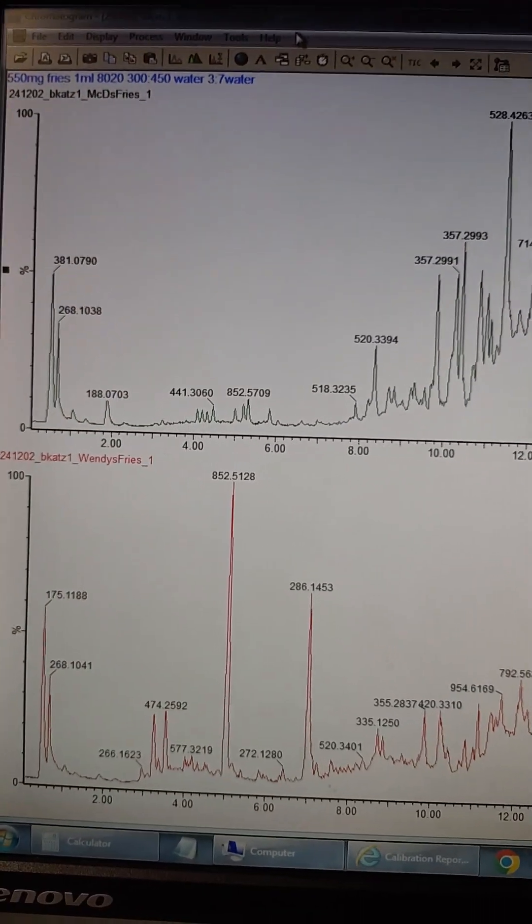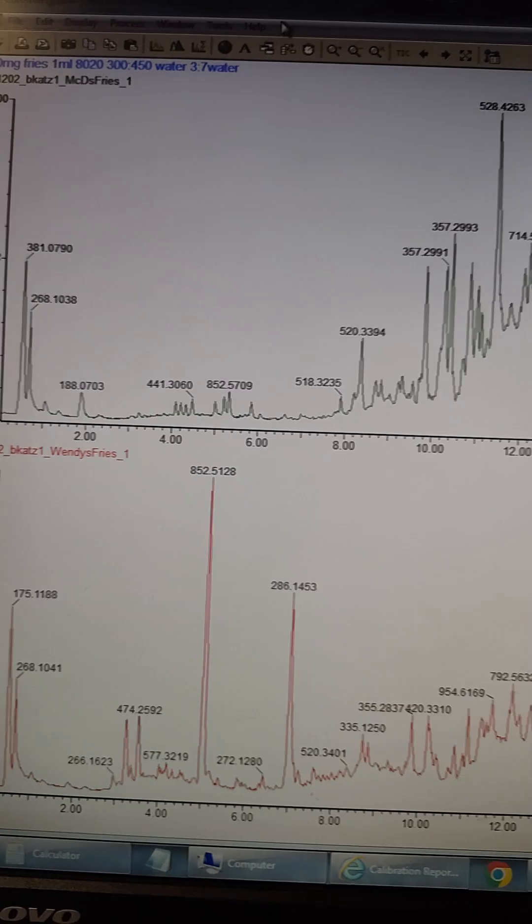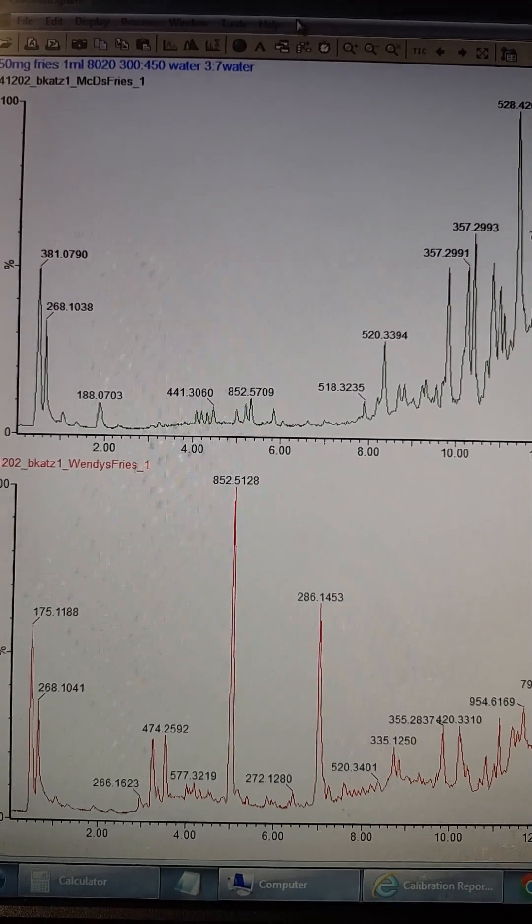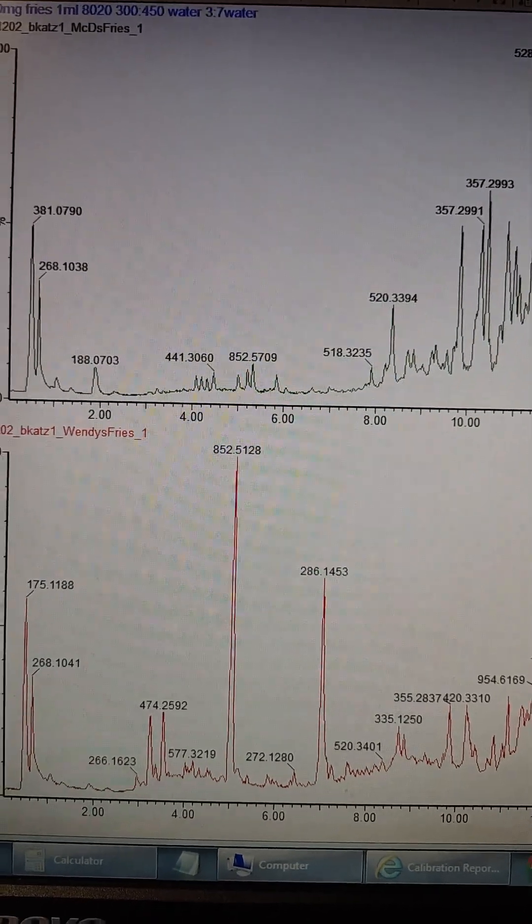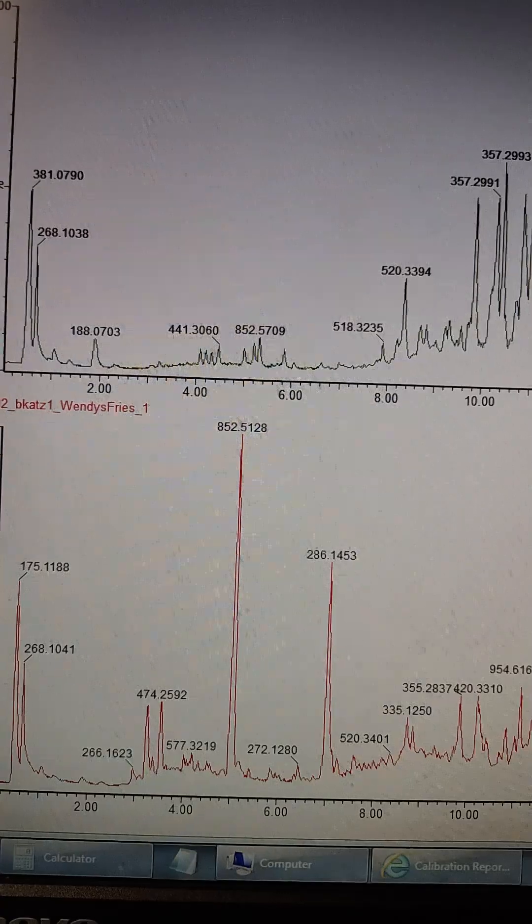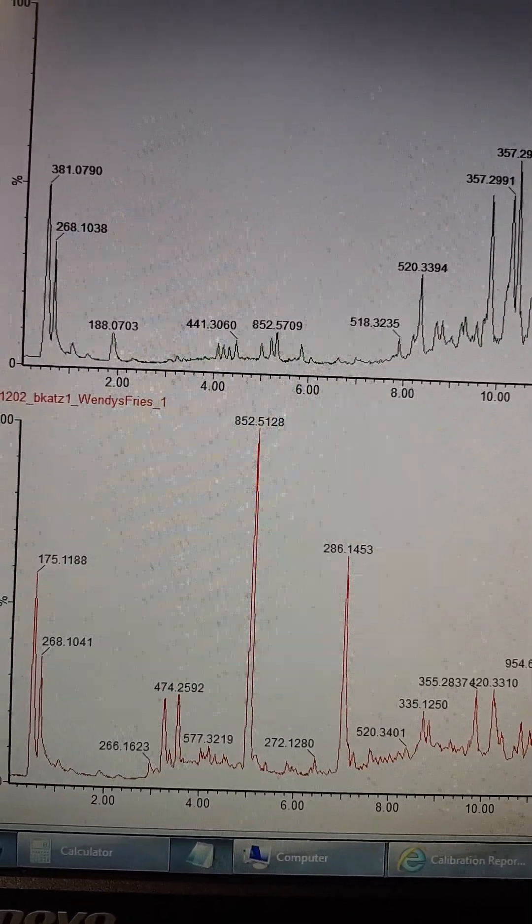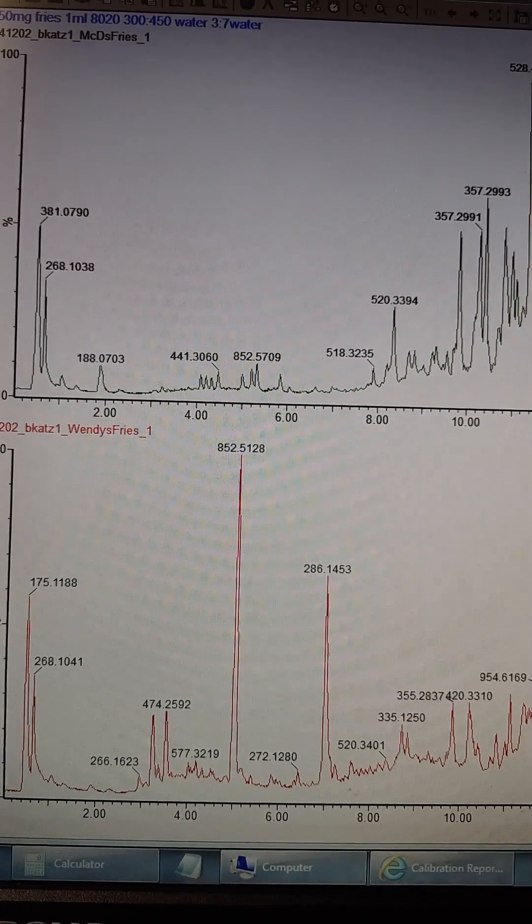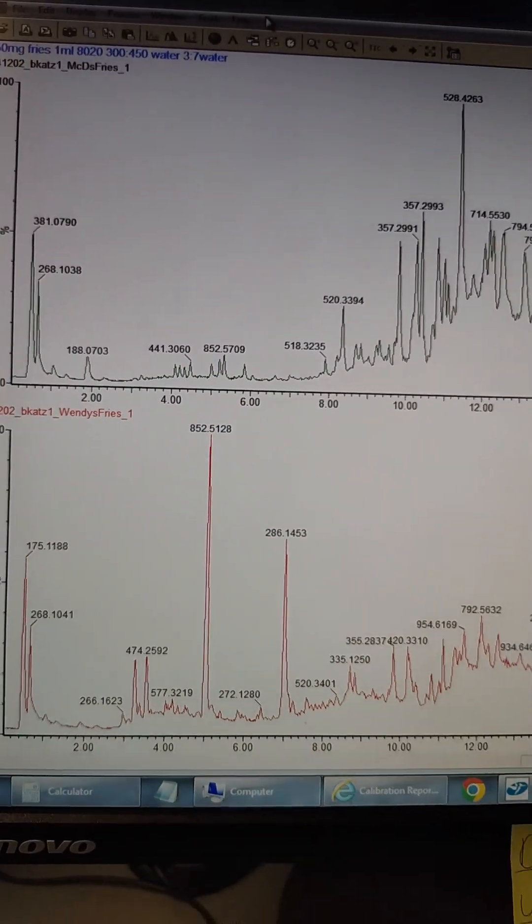Wendy's fries versus McDonald's fries. The McDonald's on top. Look at the difference right away. I mean you could probably see it. I've been talking about this green potato toxin in the Wendy's fries. There's an enormous peak at 852. Then miraculously enough, I did not expect this. There looks like there's almost none in the McDonald's fries.